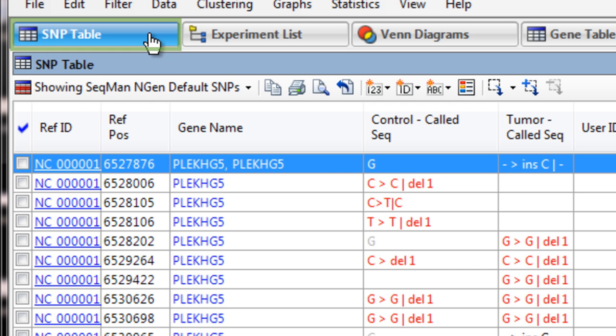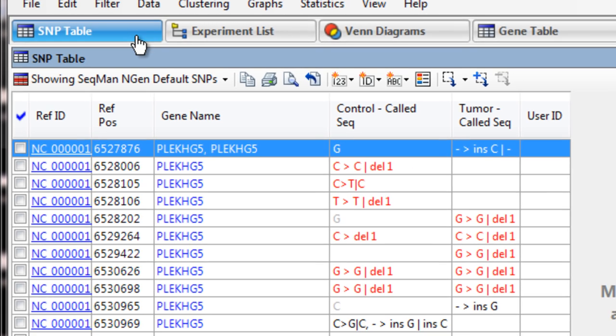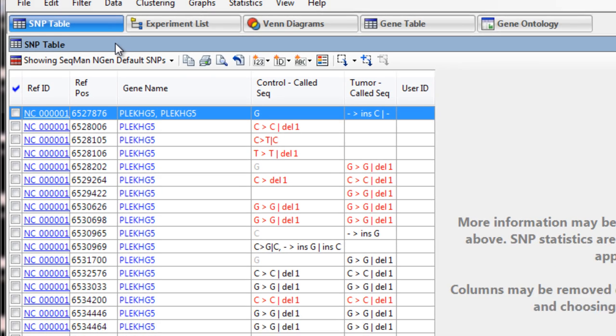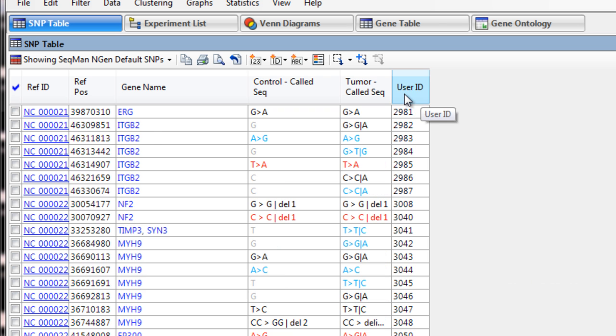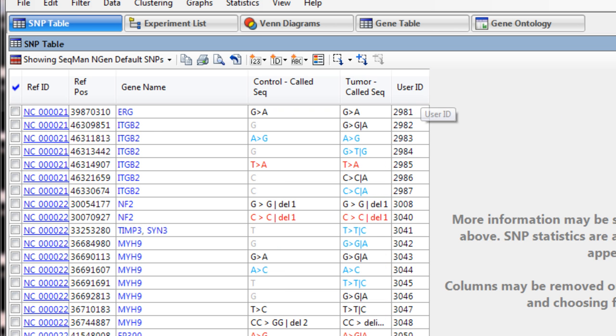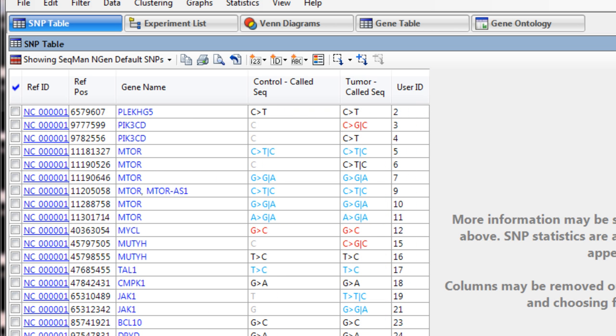In the SNP table, you can see we still have the user ID from the VCF file used during assembly. If we sort on this column, we can see all of the VCF file SNPs grouped together, including those which are missing from either assembly, shown in gray text.